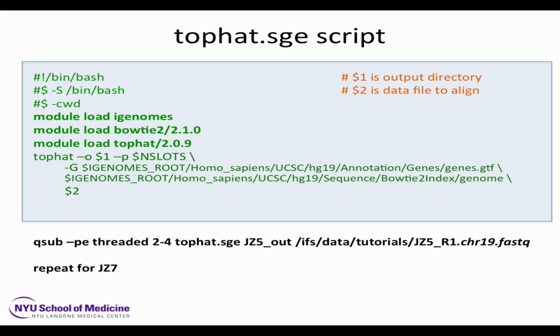One more thing that you'll see is, since we already aligned these to the genome and then only took those reads that align to chromosome 19, you're going to get an unrealistically high alignment percentage. Nearly every read is going to align because we already know that these reads align. In a real RNA-Seq data sample, you never get more than 90% of the reads aligning, and even 80% is not a huge cause for concern.